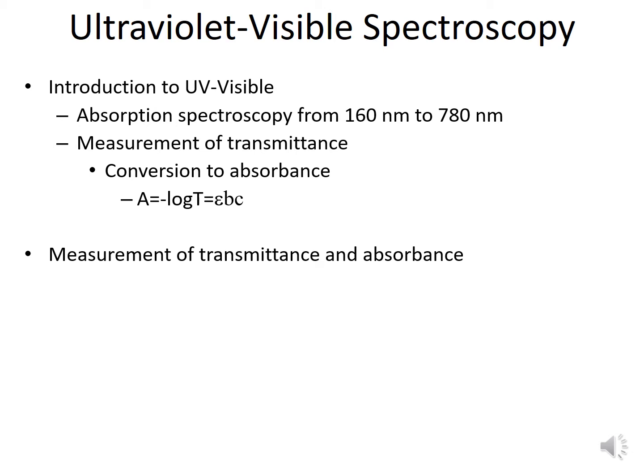Here you can see that it also equals negative log transmittance. So this is the conversion between transmittance and absorbance.